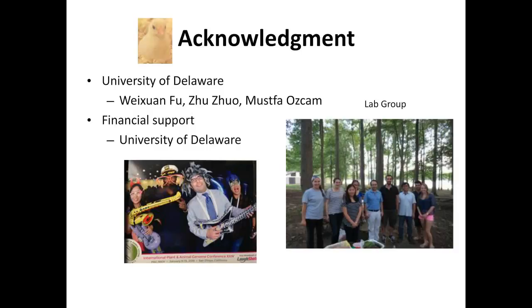That's why we wanted to remove those sites, to not have false positives. So if the question is talking about the issues that cause the poly-A stretch, the only way that we can solve it is using a bioinformatics way.